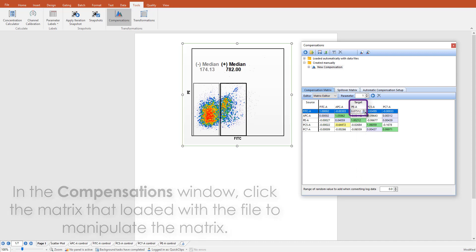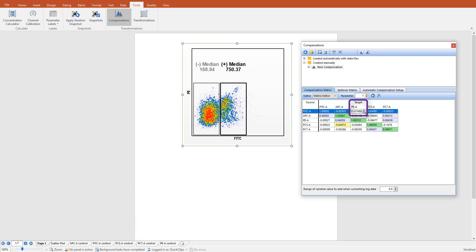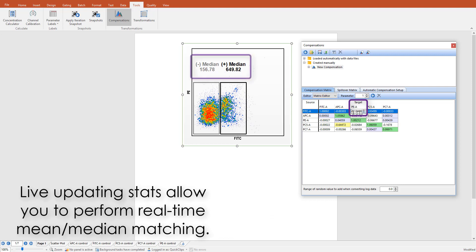While we do not recommend manual adjustments on the fly, take advantage of live updating statistics, such as media, to better characterize the subpopulations during compensation adjustments.